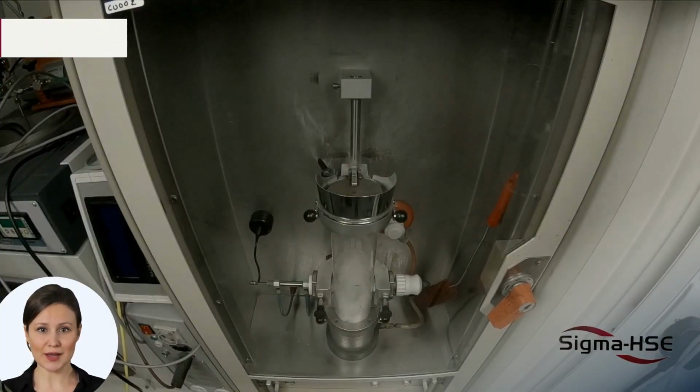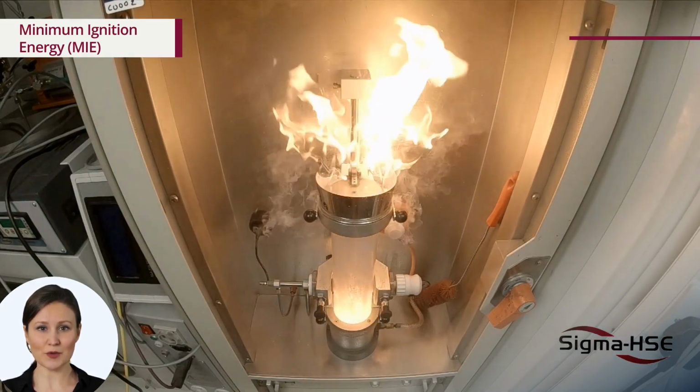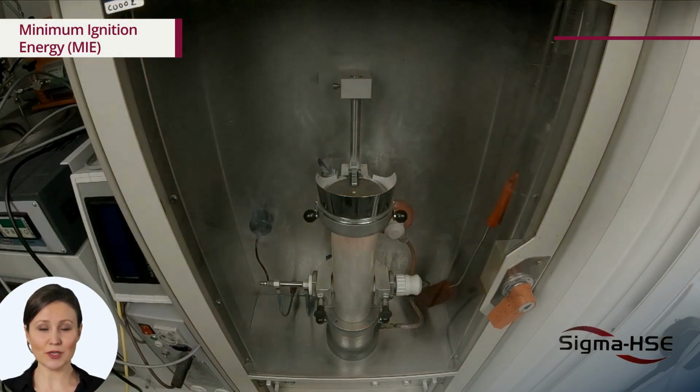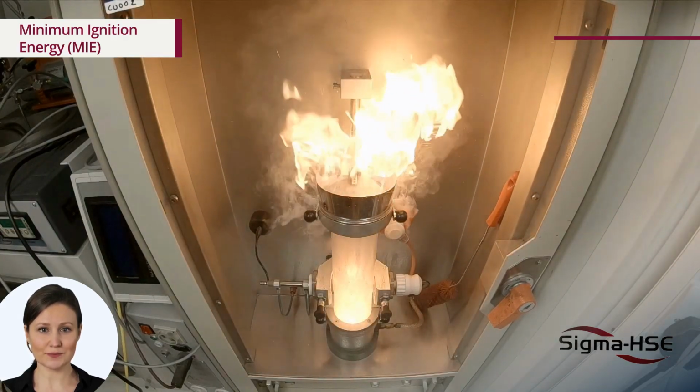Minimum ignition energy, MIE. The minimum ignition energy test is conducted to determine the lowest spark energy that can ignite a powder when dispersed in the air as a dust cloud. A purely capacitive generated spark is used to assess sensitivity to electrostatic discharges such as brush, spark, or transitional propagating brush discharges. An inductive spark is used to assess sensitivity to mechanical and electrical discharges.